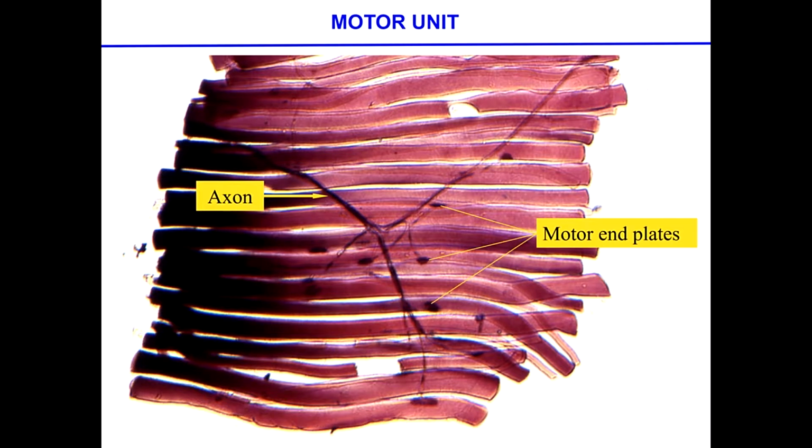All right, so we've seen a picture similar to this one in the lecture. This is the way the nerve is coming to a motor unit, and how this formation of the so-called motor end plates, which are where the synapses are, and how the signaling is transmitted. So these kind of buttons plugging into the muscle fiber are going to be able to direct the movement of the fiber itself. Questions?